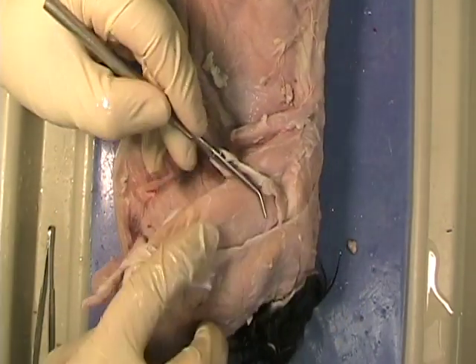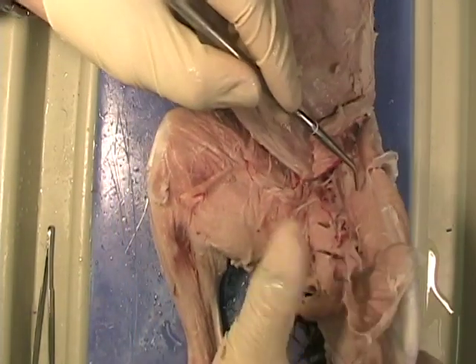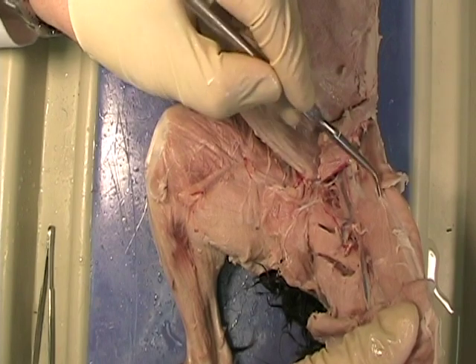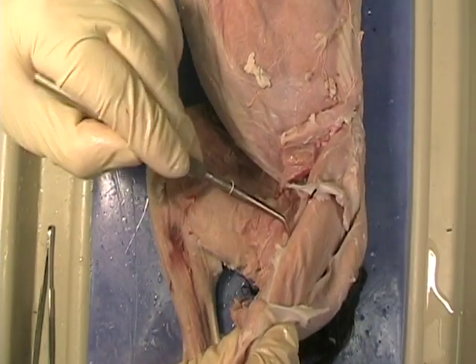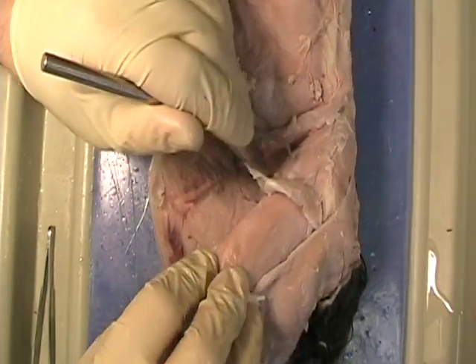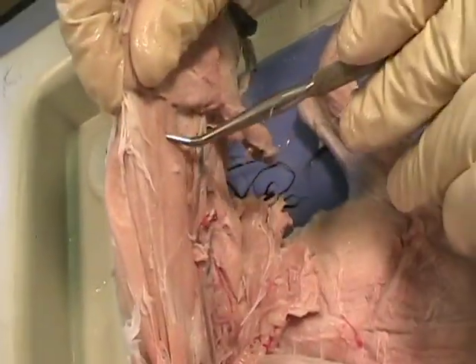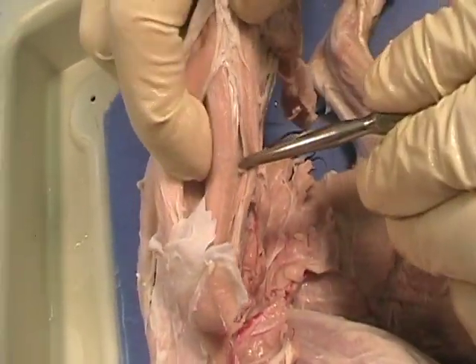Now with this out of the way, we can start to see what's underneath. Right here we have the vastus lateralis, because it's very wide and vast, and it's on the lateral side. Here we have what's called the vastus medialis, because it's on the medial side. And in the middle, in between, there's another muscle called the rectus femoris, because it goes straight up and down the leg, in the femoral region.